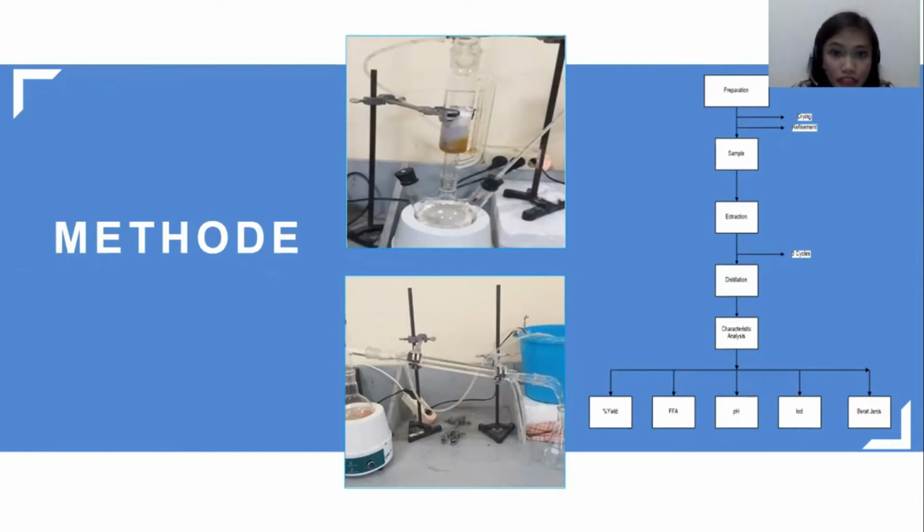The method in this research is extraction and distillation. The next process is to reduce the particle size. The particles are put in the crusher so that the sample becomes smooth. The sample is screened using a sieve with a size of 70 mesh in order to obtain a finer powder.